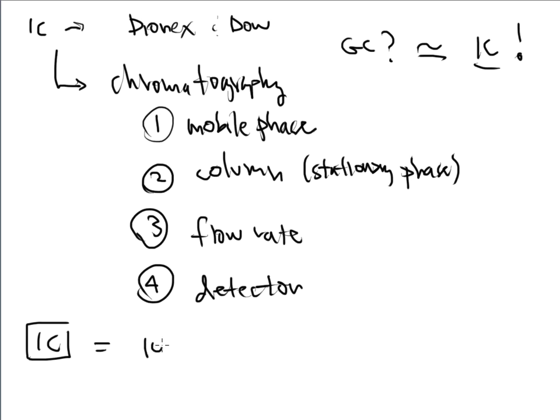So ion chromatography, as you would expect, will separate ions, and those ions, I'm also going to put slash polar compounds, because when people think of ions, they think of something like Ca+2, calcium, or Cl-, chloride. The reason I'm putting polar here is because they don't necessarily have to be single cations or anions that you measure. So, for instance, CH3COO-, that is acetate, a complex molecule versus just the simple little ions. But this thing is charged, and it can become polar, and it can go through the system and be detected out the other end as well.